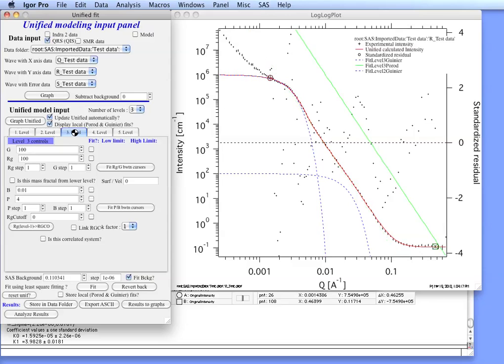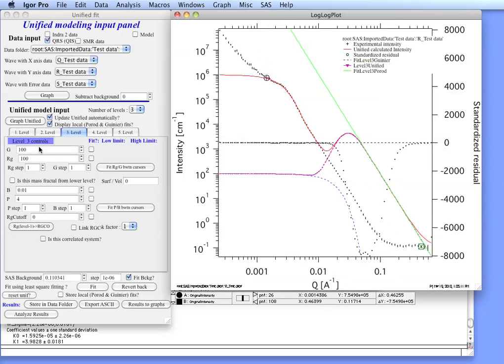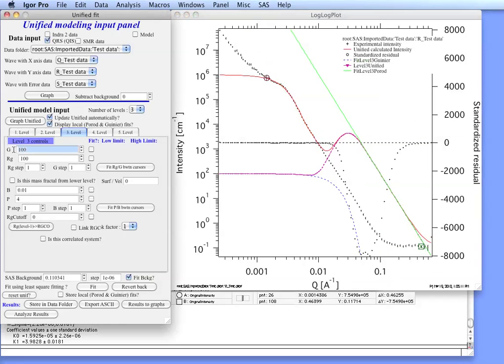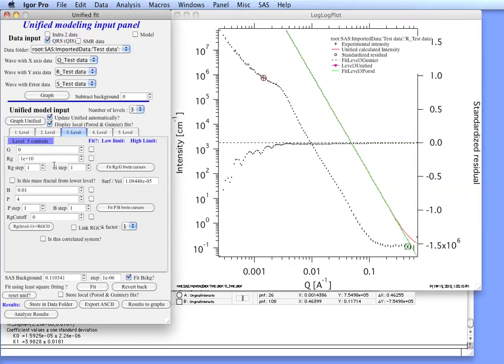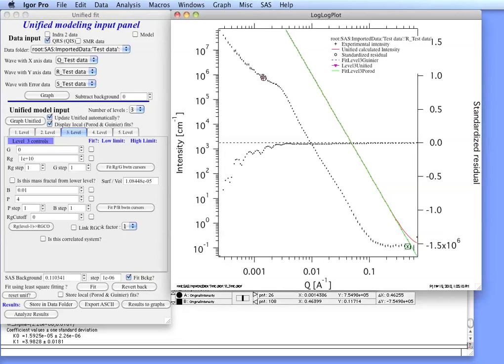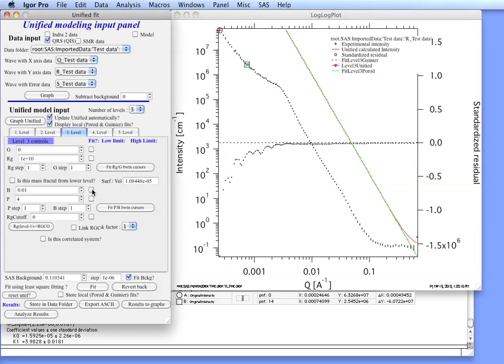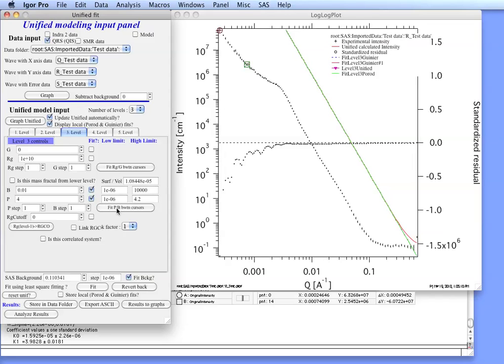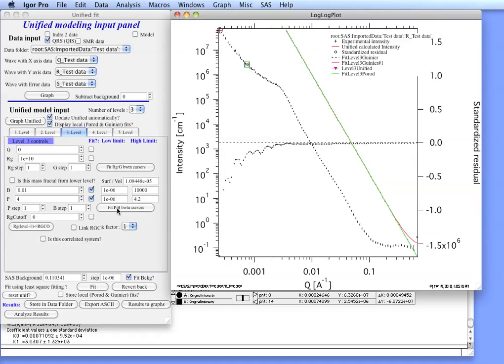Since we do not have a Guinier area for this specific level, what we will do is we will actually set G to equal 0. And you can see that the RG will set to a really large value. It is important to realize that this can be done only for the highest level because by now you cannot have anything larger than what you already have here in the unified fit. The next thing what we want to do is select the area up here with cursors. Select B and P and do a fitting on them.